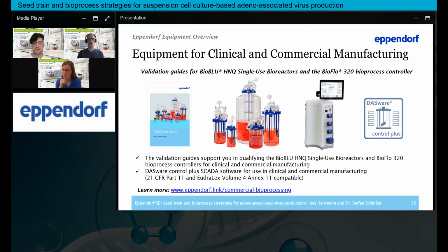The HEK cells that were used are suspension adapted, but the original HEK cells, I was working with them also in the lab some years ago, are usually adherent cells, so they need a surface to attach to. If you want to realize this in a bioreactor, you can basically use certain scaffolds. For example, a microcarrier, which are little beads, for example made from polystyrene, but there are also different materials used, which you can add to your bioreactor, where the cells can attach and then grow.